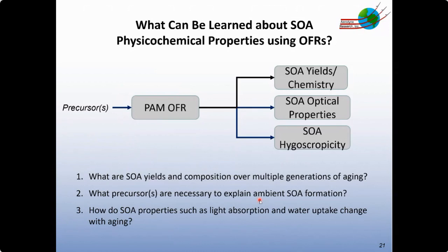But then in other cases, it may be of interest, as I said, just to use it in a similar way as a smog chamber, to look at the properties of SOA, such as their water uptake or their light absorption efficiency, and how they change with aging, and are they correlated in any way that can be parameterized in models.